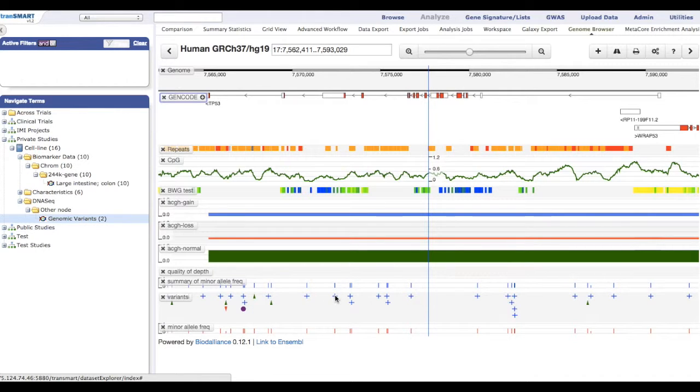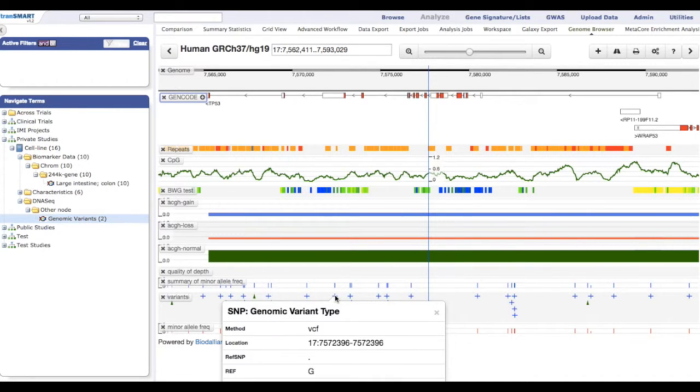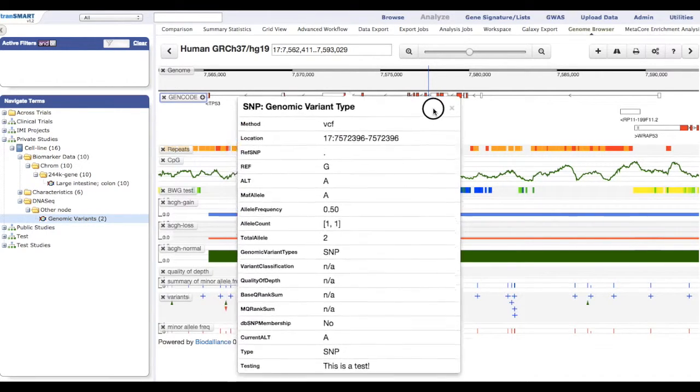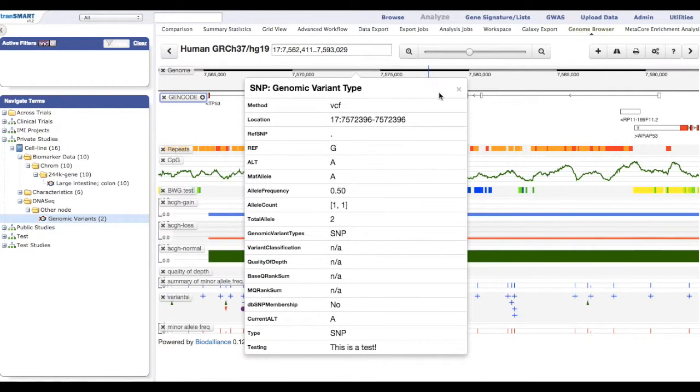When hovering over a specific variant, additional information can be displayed, for example, allele frequency and minor allele frequency.